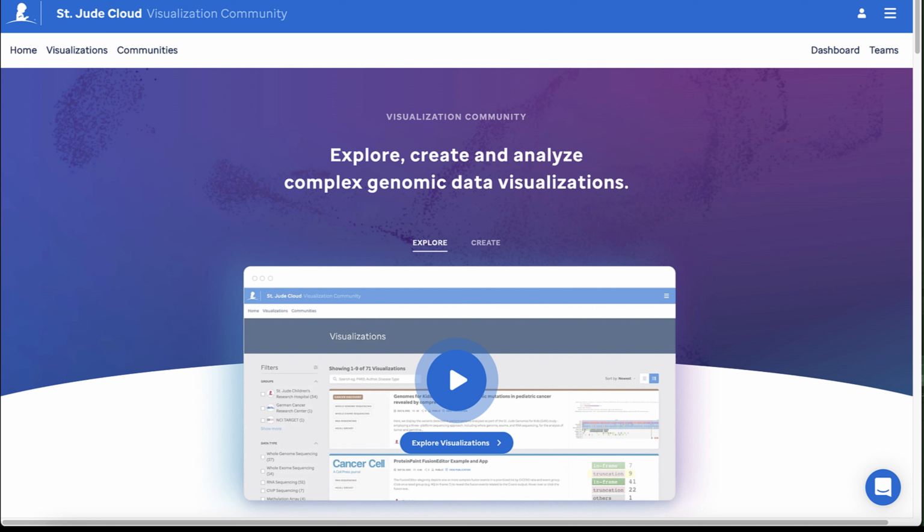In this video series, we will learn how to create a visualization using ProteinPaint or GenomePaint within the VisCom platform. In this video, we will learn where to create a visualization and how to create a template within VisCom. Before you begin, please contact support@stjude.cloud so that we can add you to a team. Let's get started with navigating as an individual. Later, we will talk about creating visualizations within a team, and I will cover the approval process in another video.